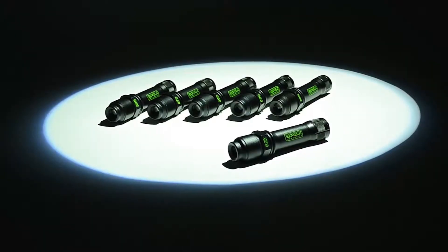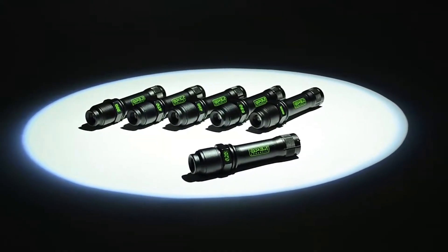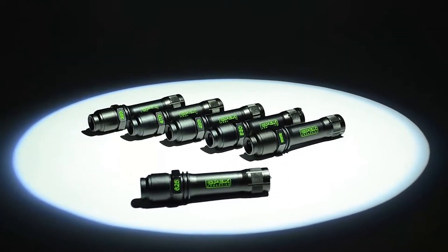The Focus is the first LED of its kind for forensic applications. With its compact design, the tightest of locations can now be searched with the intensity of an alternate light source without the bulk.